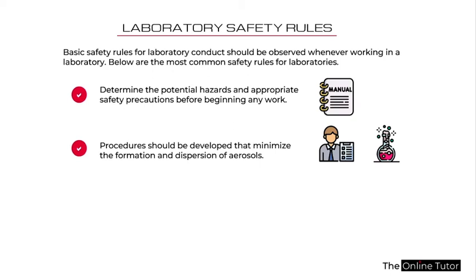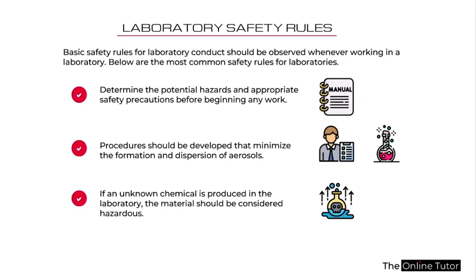Send the methods or the methodology to your supervisor to scrutinize for you to make sure it is safe enough for you to carry out in the particular laboratory you find yourself. So always make sure that the procedures you are using to form the product that you want to form or synthesize always minimize the formation and the dispersion of aerosol for your personal safety and the safety of others around you in the laboratory.